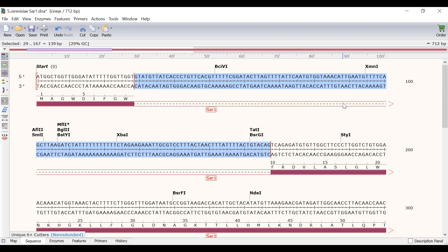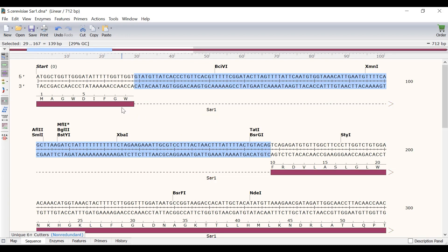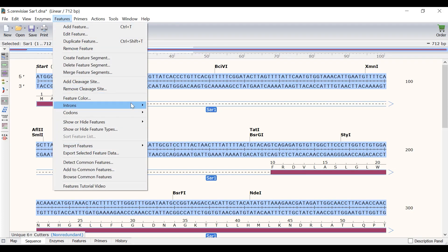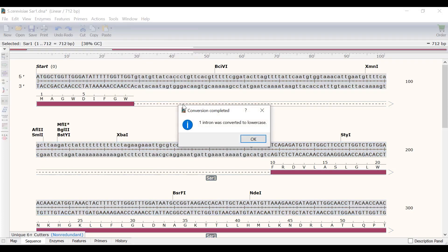If desired, you can always convert the intron sequence to lowercase by selecting the feature and going to features, introns, convert introns to lowercase.